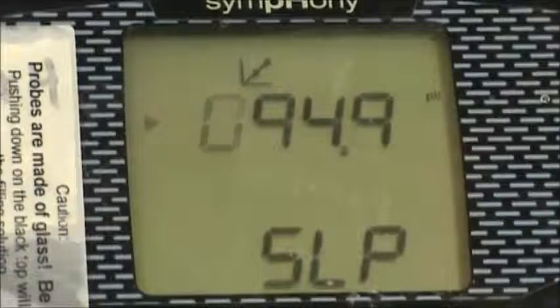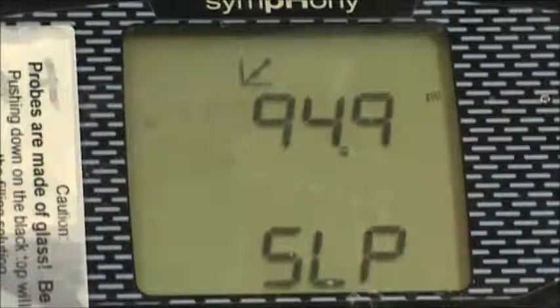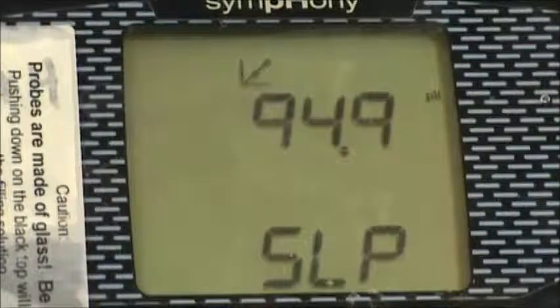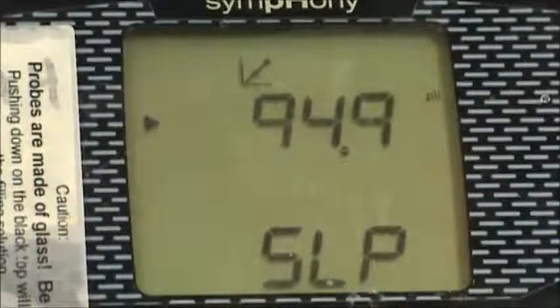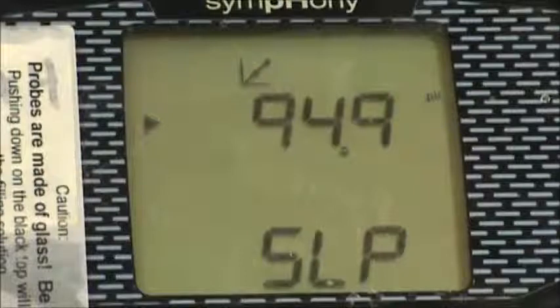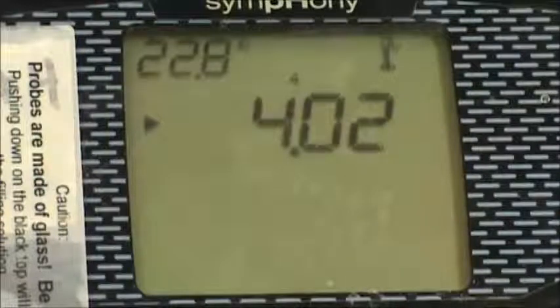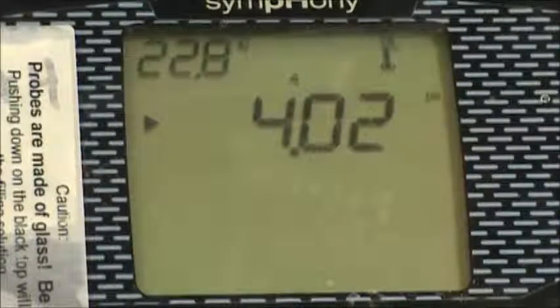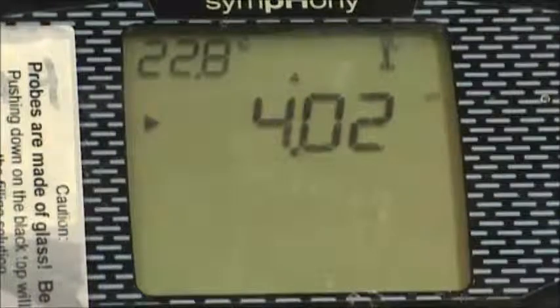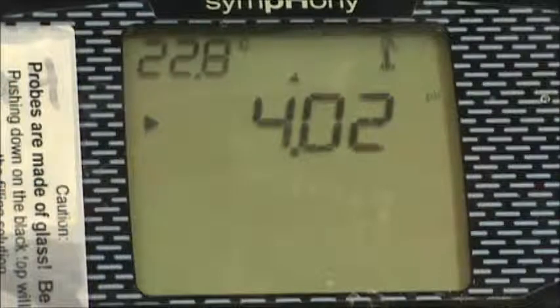The screen should change to read SLP at the bottom. Press measure a second time, and the screen should revert back to showing the correct pH measurement. The value of the buffer solution should also be shown above the pH reading on the screen, and the measurement icon should be shown in the upper right-hand corner.